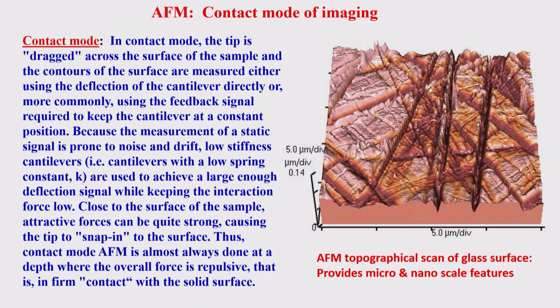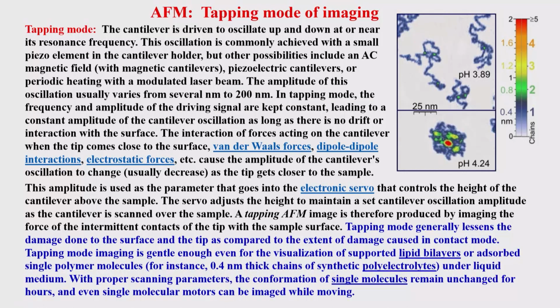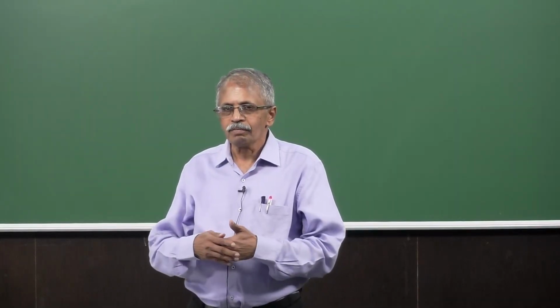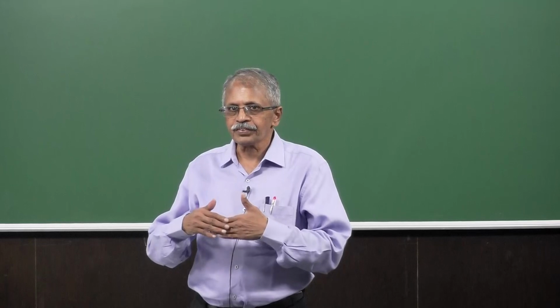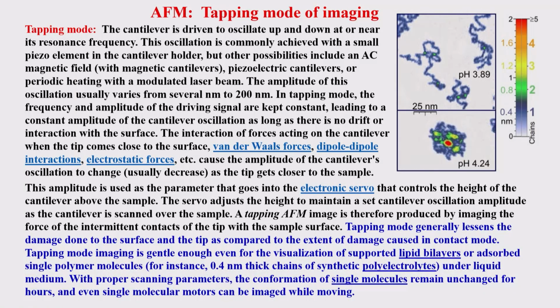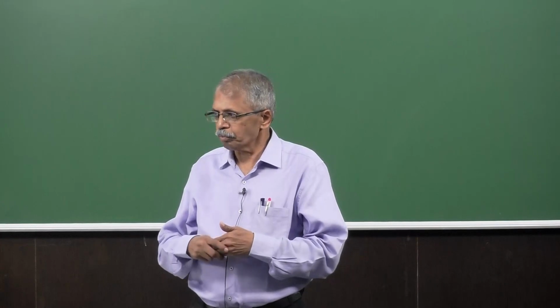There are two modes, as I mentioned. One is the contact mode, the other is the scanning, the tapping mode, which is the more favored one, because the tapping mode will not touch the surface. So either the surface as a sample or the tip or the probe do not get affected, and so therefore in a lot of cases people have been using it more.